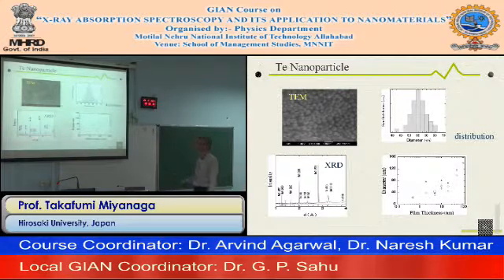This is the relation between our controlled thickness and the real diameter estimated from the TEM photograph. We call the 10 nanometer thickness about 55 nanometers in diameter. Even at 1 nanometer thickness, it has about 20 nanometer diameters. So this is a calibration line.